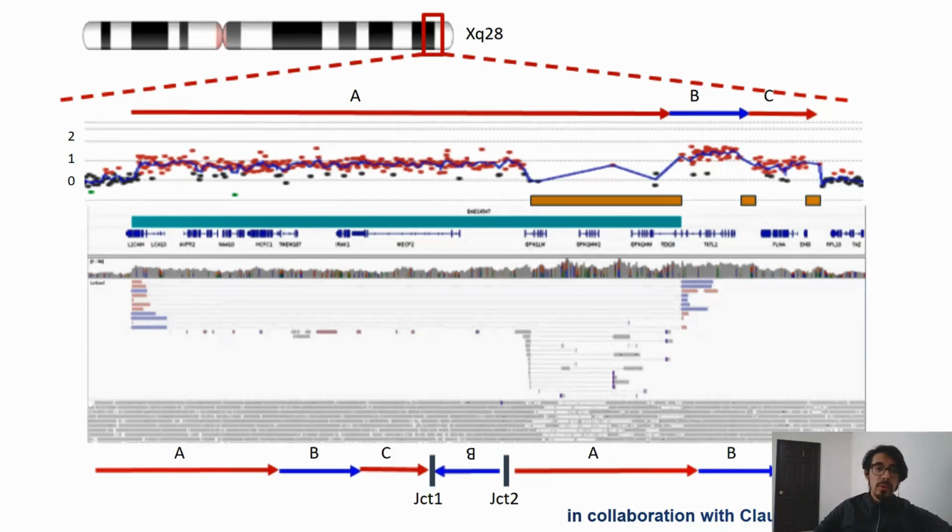Beneath, we show you the split reads that we used to identify this inversion. Those are colored in pink and blue. Finally, you can see that there are many gray reads beneath, and some that are white. Those are showing the segmental duplications. So in this case, Sniffles 2 was only able to detect one of the 2 junctions because the other one falls within the segmental duplication, and thus it's very hard to detect them.